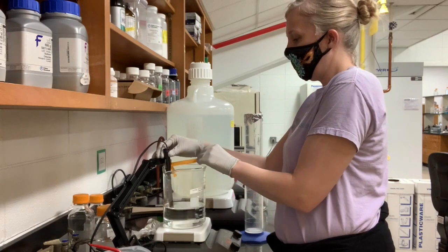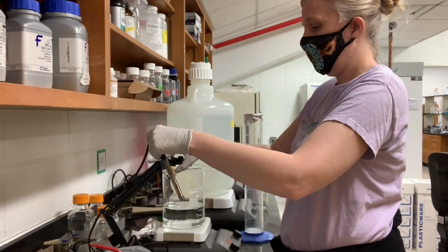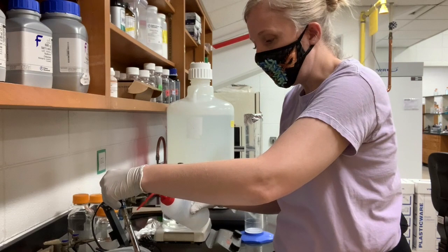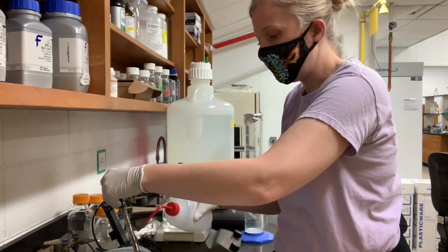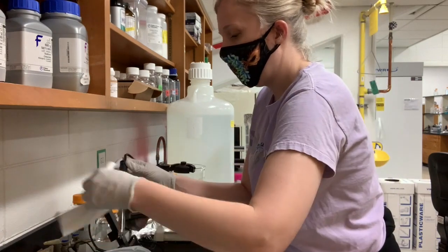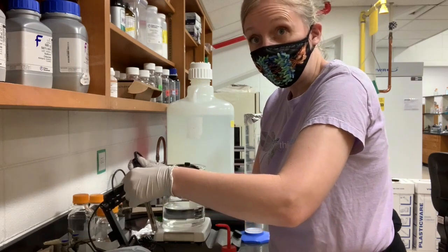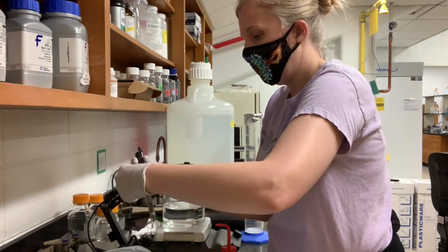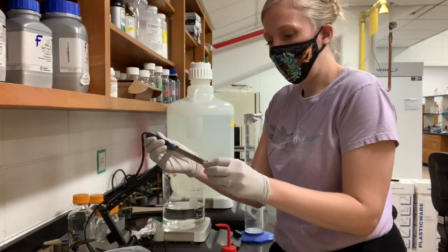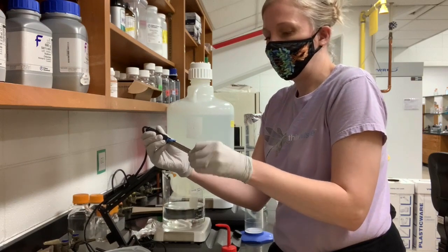So I'm going to carefully remove the tape. I'm going to take my probe over to the waste container and rinse it off again. You know, you don't want your solution to be contaminating the next person's work. I'm going to dry it off with the chem wipe. I'm going to replace the blue plug into the little hole that's on the meter. And then I'm going to take this little lid for the bottle and replace it.